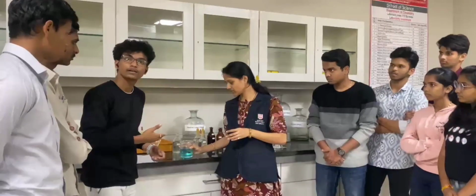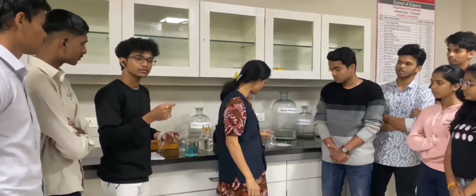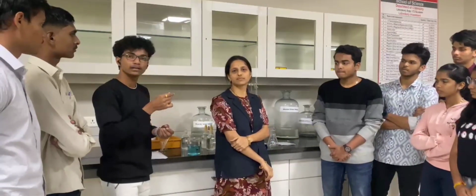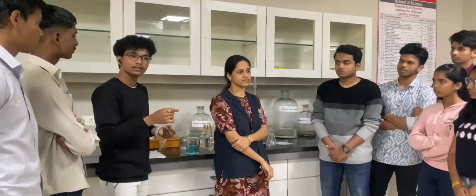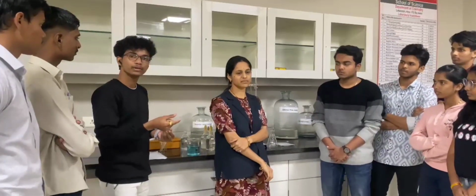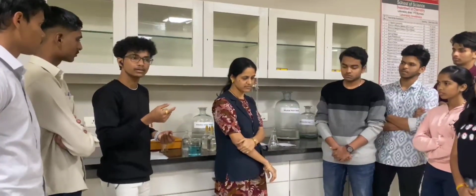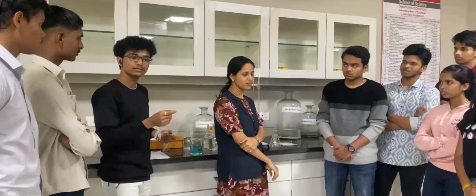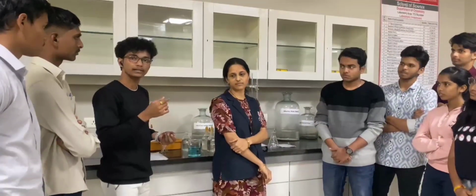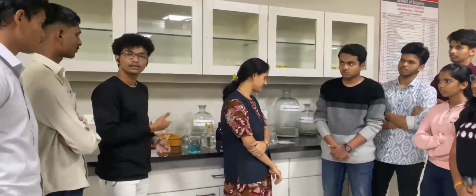This stock solution is prepared by taking brass in a titration flask, adding concentrated nitric acid and concentrated sulfuric acid, and we have to heat that flask till the nitric acid is completely expelled and white fumes of sulfuric acid are evolved. Then we have to dissolve the residue, which consists of sulfates of copper and zinc, in distilled water. This is how we prepare this stock solution.